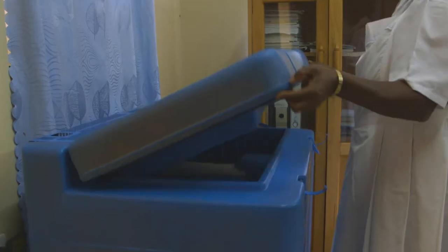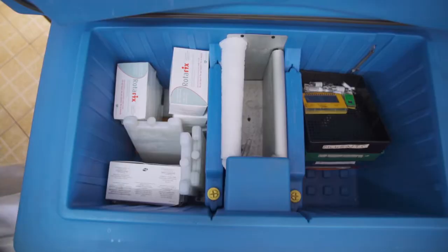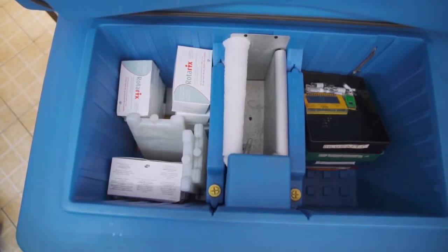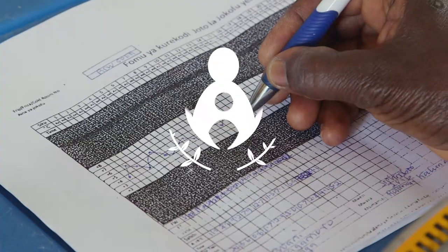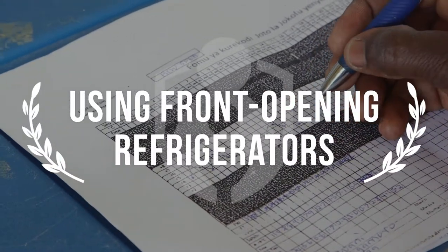No matter what kind of refrigerator is in your facility, it is important to know how to arrange vaccines, diluents, and water packs to keep them at the right temperature. This video will review specific rules for front-opening models.